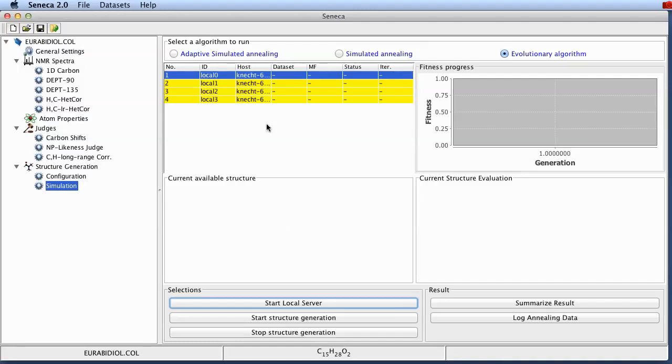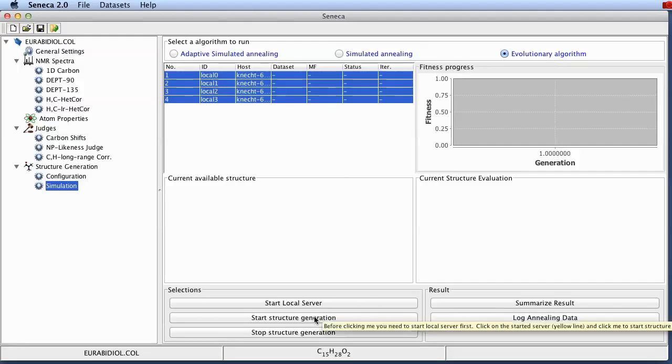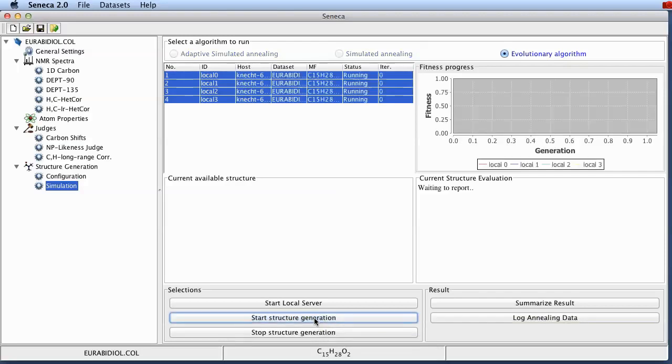You can also run this type of computation on a local Beowulf cluster but that's a different topic. So in order to start the computation you would just select all of the servers by holding the shift key and clicking on the last column. And then you can click on the start structure generation button down here.